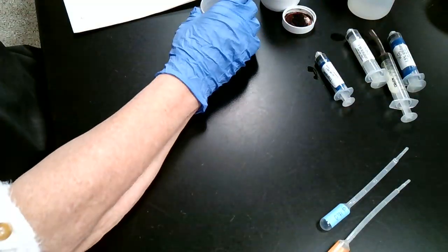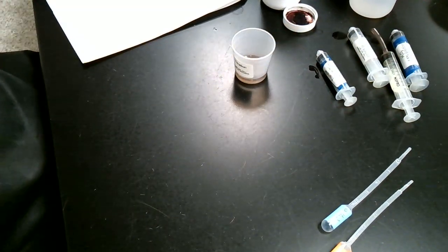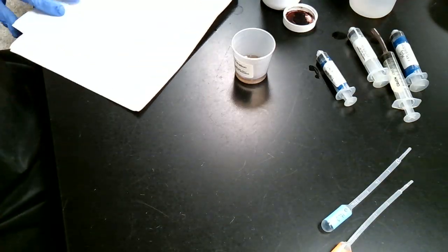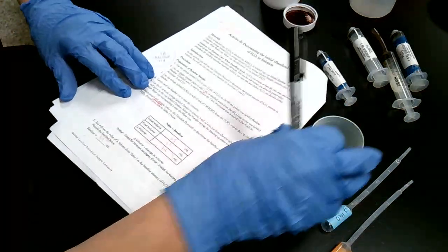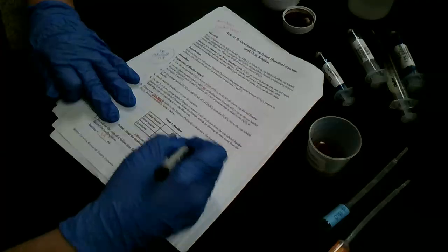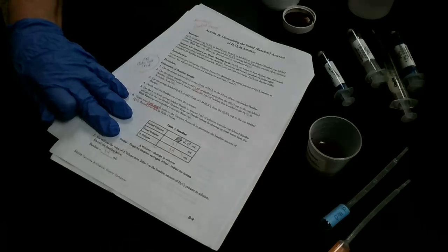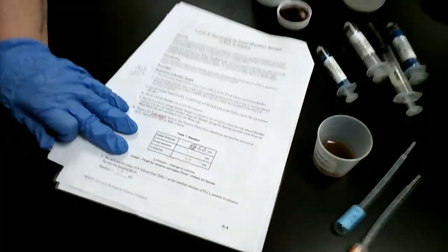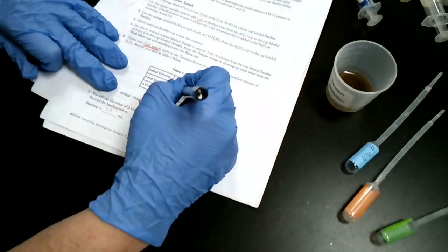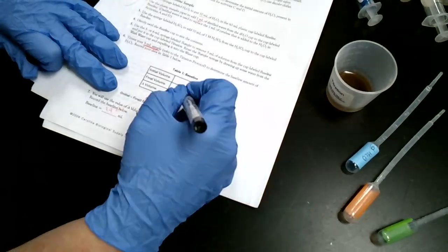Okay, now I'm going to write in new numbers here. Hopefully this pen works here, and you can see where I'm putting these numbers. I have old numbers from like last year in here, but my initial volume was 5.0 milliliters. I don't know if you can see that. Hopefully you can. Okay, my final volume was 3.9 milliliters.